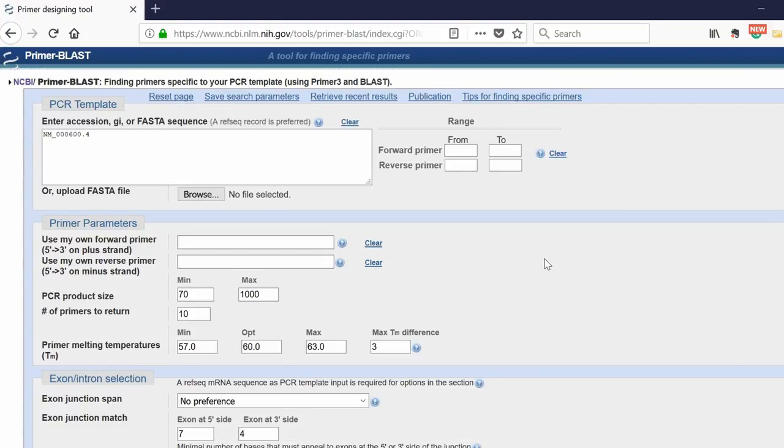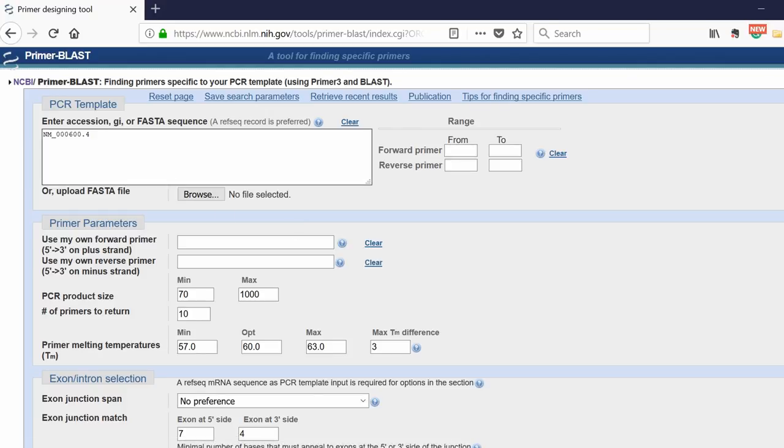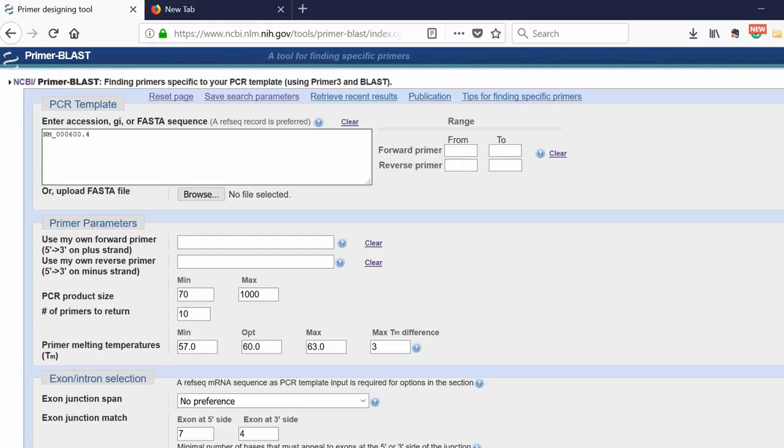Now you've been presented with quite a lot of options that you can change here. I'm going to give you some optimal settings to start off with, and you can alter these if you wish. Let's start with the top box, PCR template. You'll notice that the accession number, essentially a unique number associated with your gene, has already been entered. You want to leave this as it is. The range is if you want to specify a forward primer start at a certain position, or a reverse primer start at a certain position.